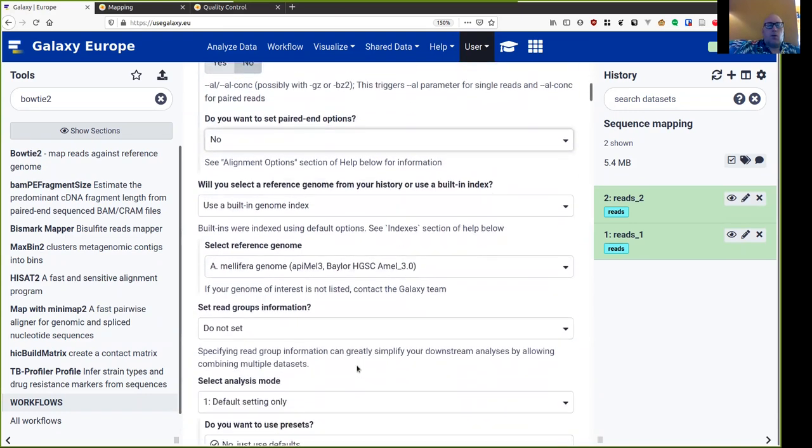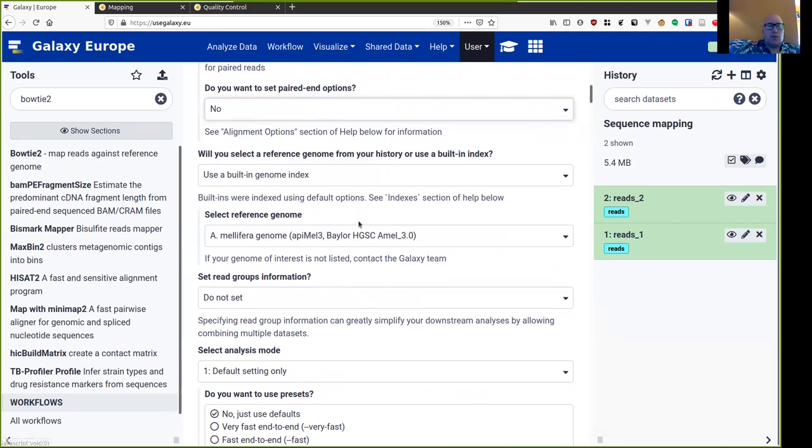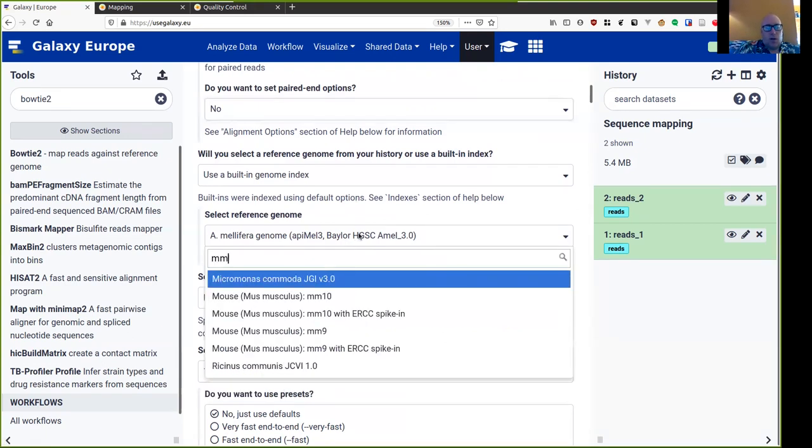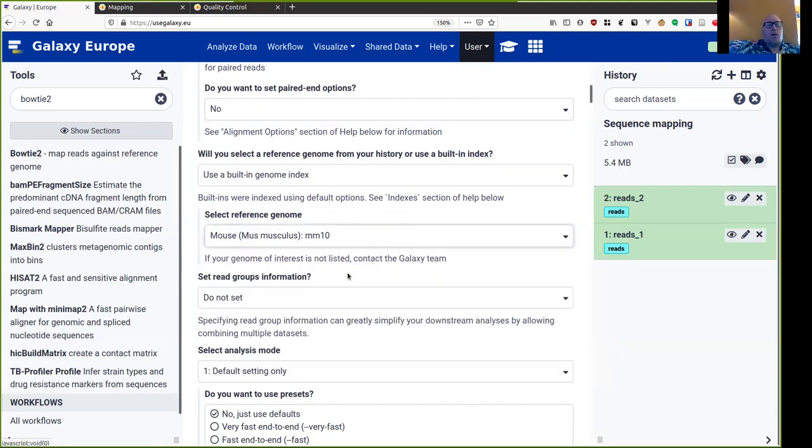So I'm leaving these as defaults. Then the question of the reference genome. At the moment we're working with mouse data, which is a model organism with a well-known reference genome. And that is built into this Galaxy server. So I can just search for MM10. And there it is. Sometimes we are working with a less well-known organism and we might bring our own reference genome, which we would load into the history and load from the history.